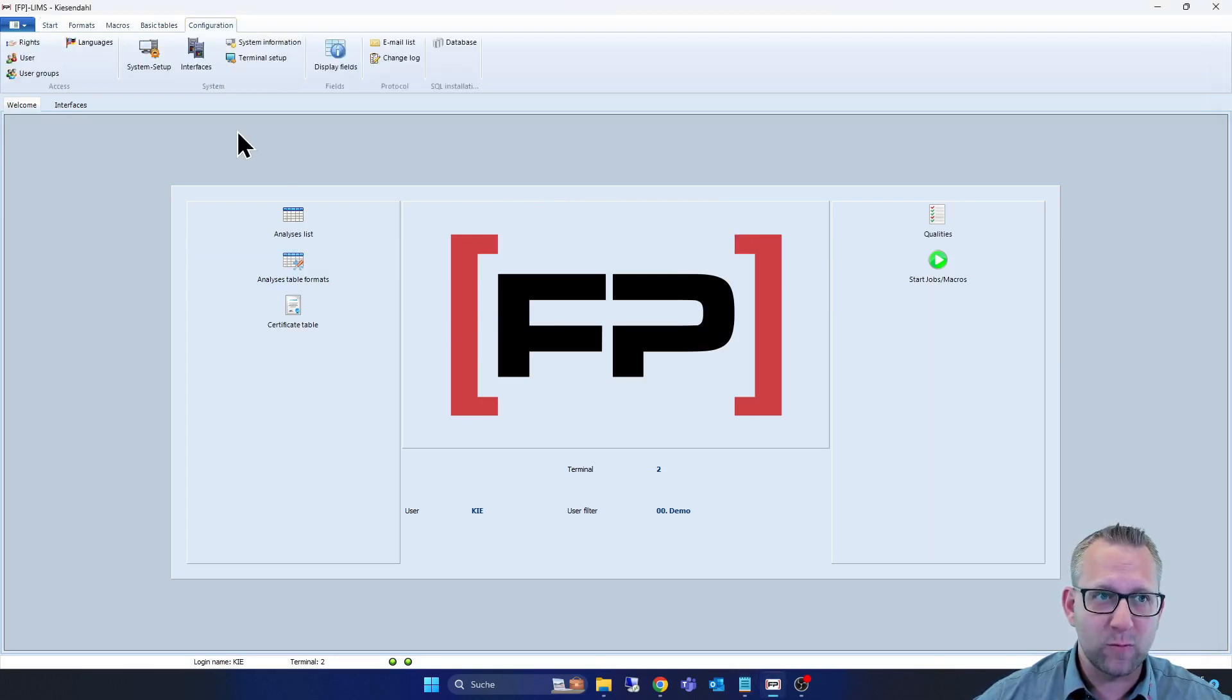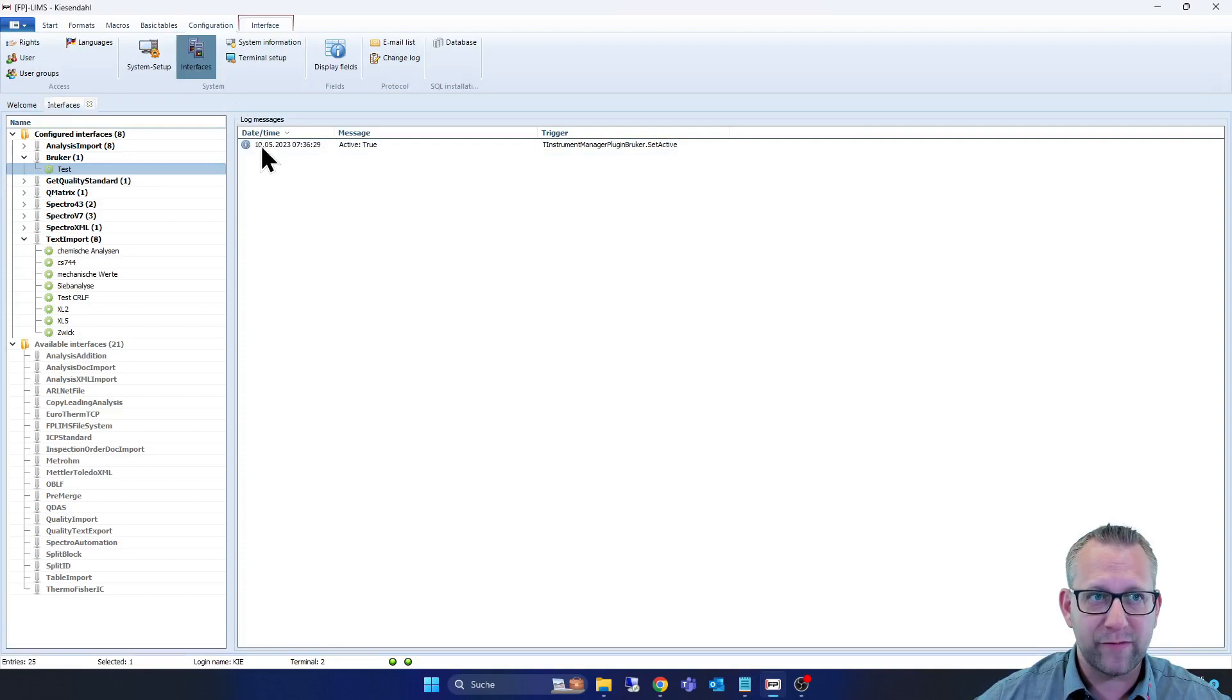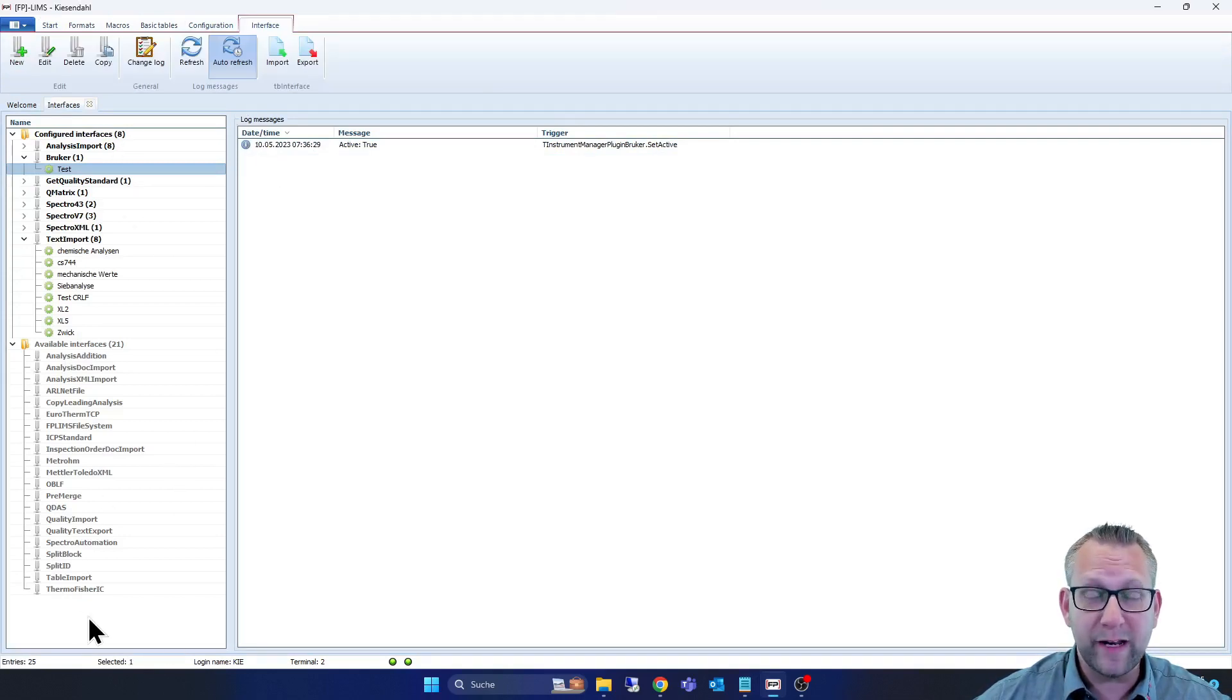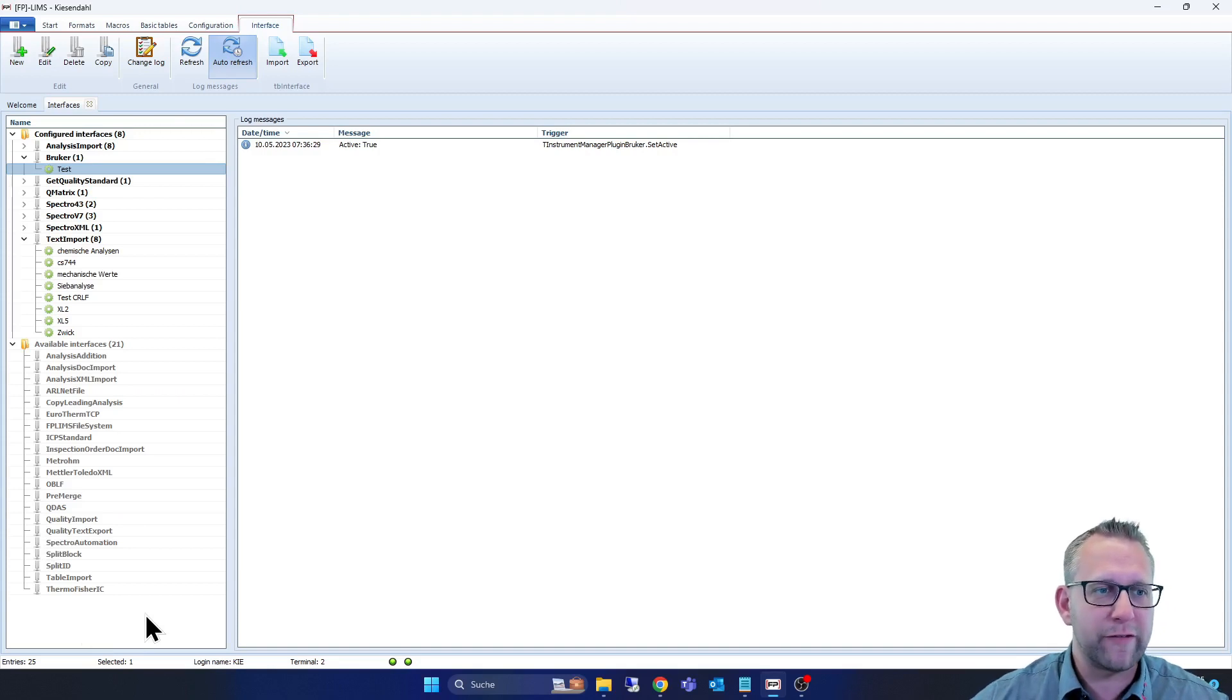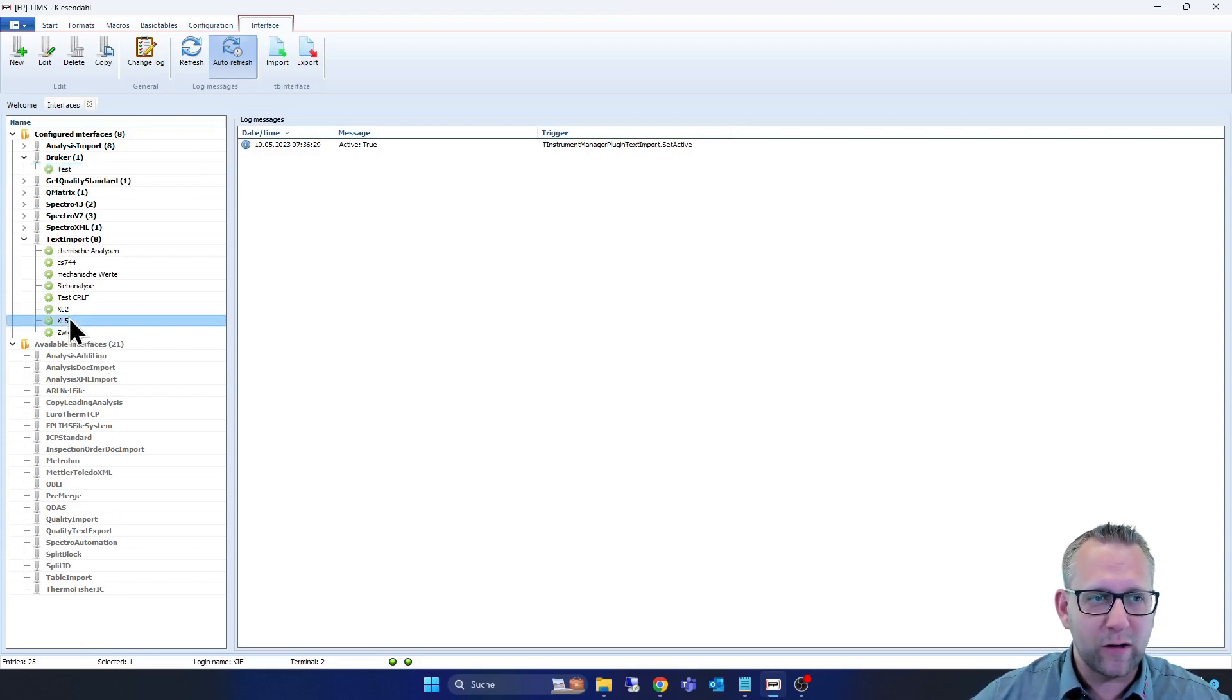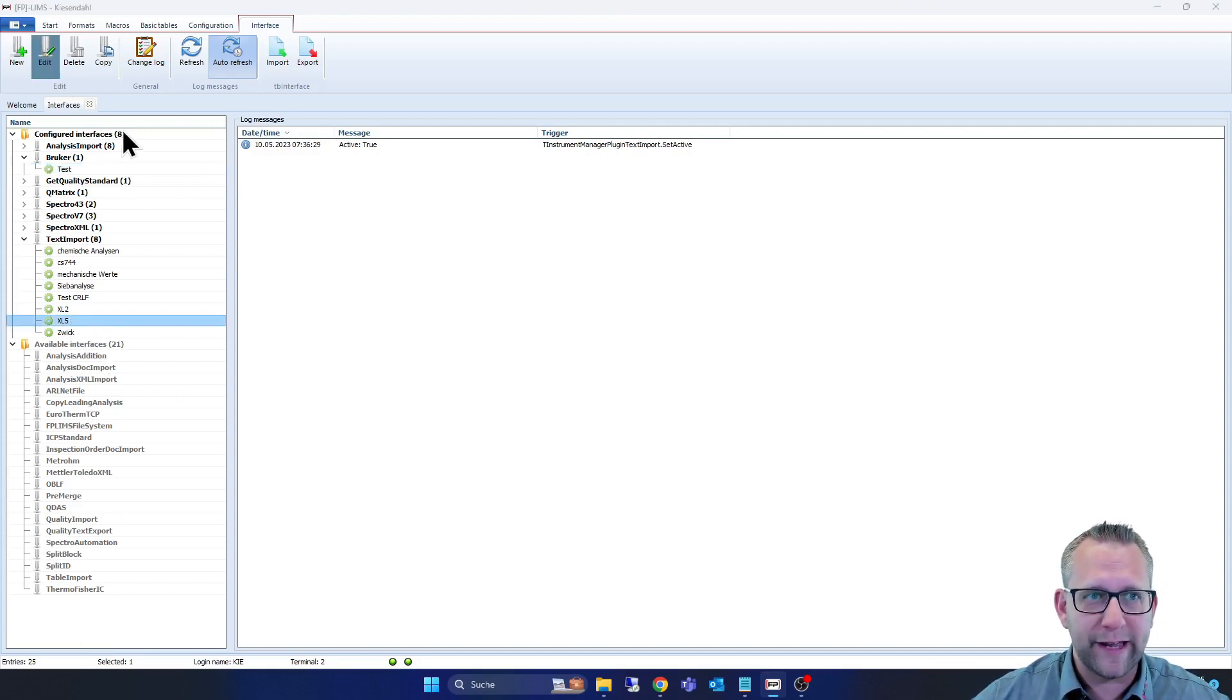Here at the welcome window we click on Configuration at the top of the window, then on Interfaces, and you see here a list of available interfaces. They are based at the standard edition in our FP-LIMS. Now we click on XL5, go on Edit.